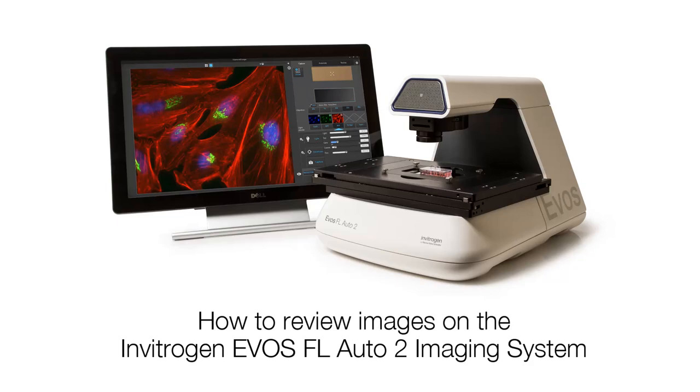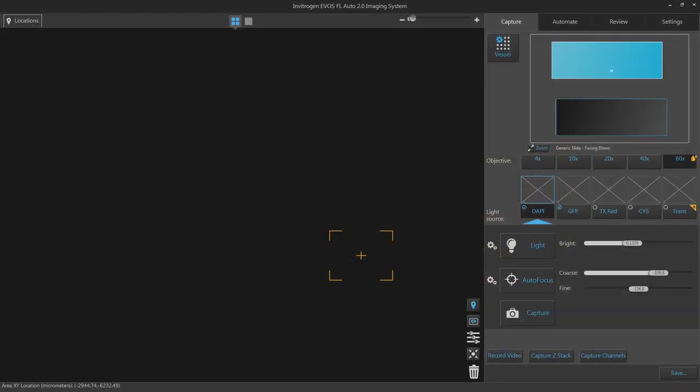In this video, you will learn how to review images captured on your EVOS FL Auto 2 imaging system. The EVOS FL Auto 2 imaging system is capable of saving images from a single field, scan, time-lapse, and Z-stack. These images may be reviewed within the Review tab.